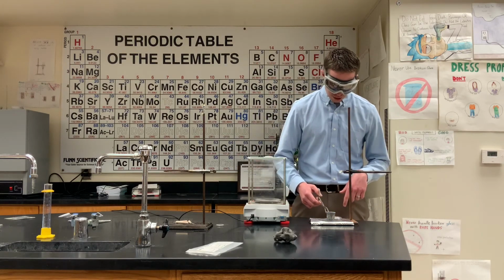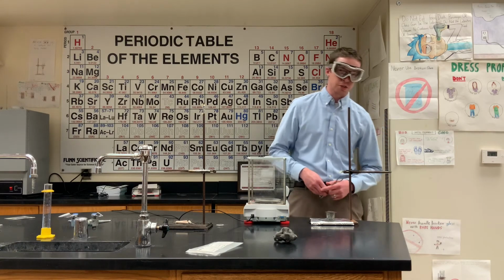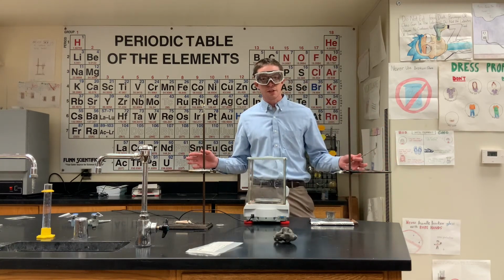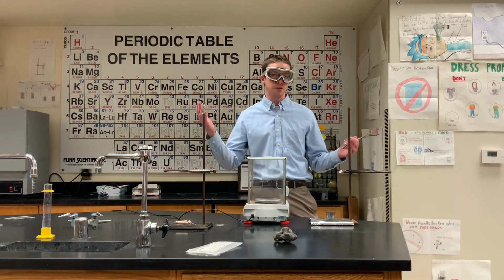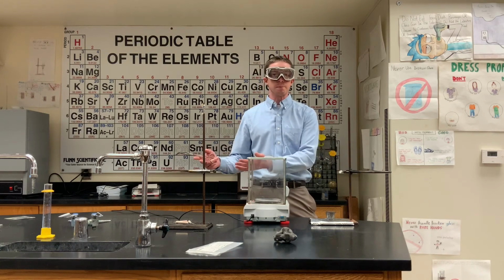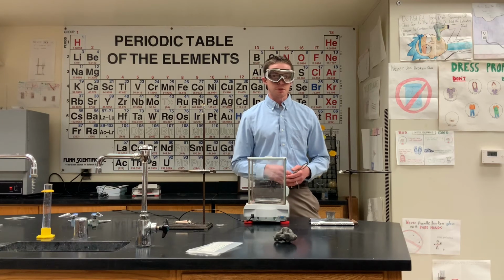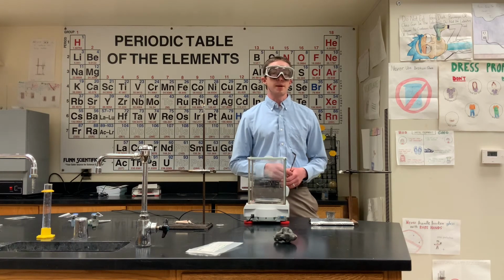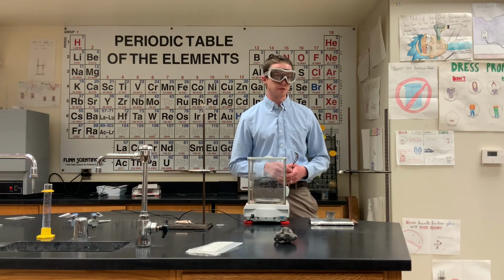Now, I've heated it. I have burned the magnesium. Generally, when you think of burning things, you think, poof, be gone, right? Your campfire logs, they all disappear. But in this instance, before we had magnesium, then we burned it. Now we have magnesium oxide. So ponder that for a second. Would the mass be greater or less than the magnesium that was by itself?